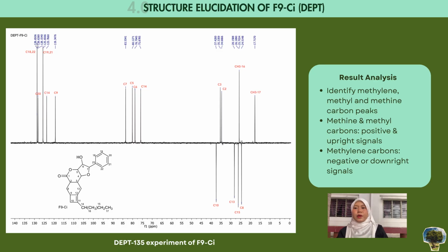Particularly, 2 methine signals were observed in the upfield region at 3.07 ppm and 2.46 ppm, assignable to the H2 and H3 positions. 4 pairs of methylene proton peaks were still resonating between 1.8 ppm and 2.7 ppm, and 2 methyl proton signals resonate between 1.5 and 1.6 ppm.